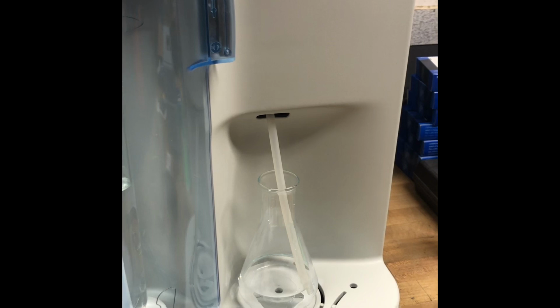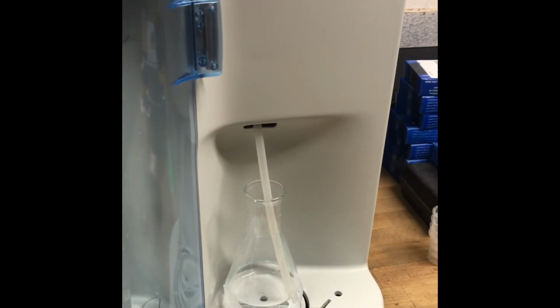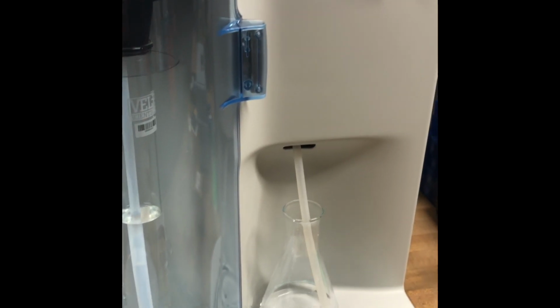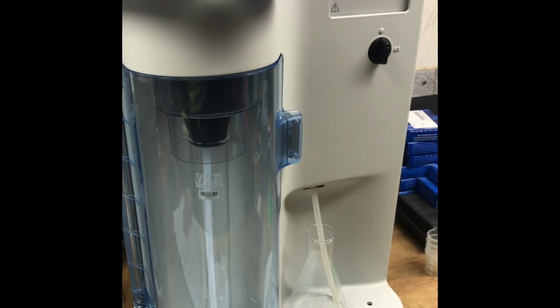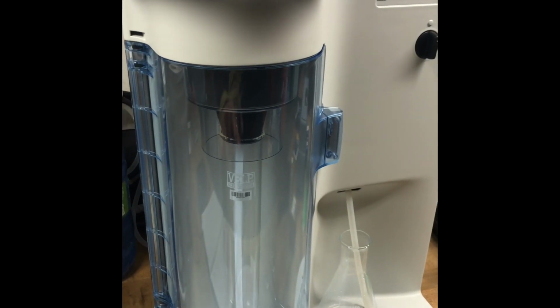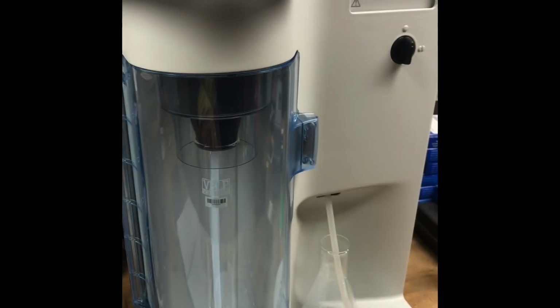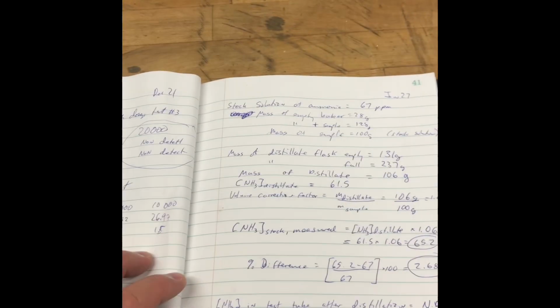So we'll wait for the last of the condensate to drip down there, and then we'll perform our ammonia analysis on that one. We'll correct for the weight difference between the original sample and the amount of distillate collected, and we'll compare the results. So the final step with the equipment is to just flush the unit with some distilled water. So all I did was I added some distilled water to the test tube and ran that through the distillation unit, and that cleans out any residue from the last test. And the final step is some calculation.